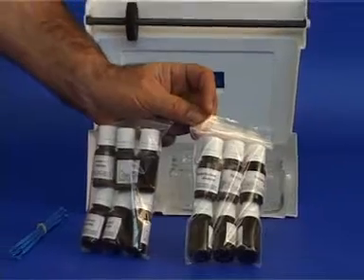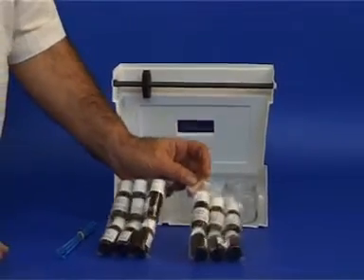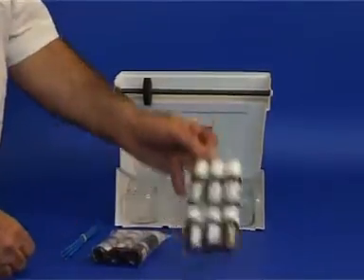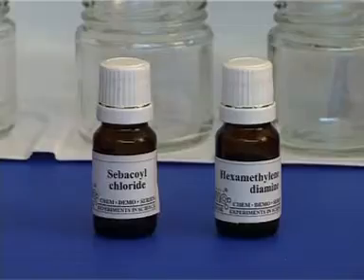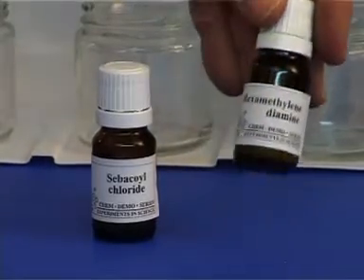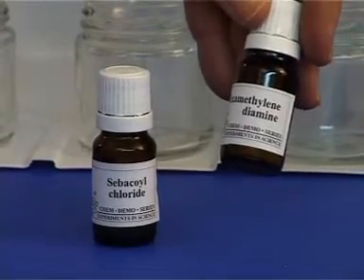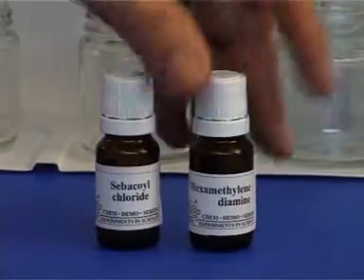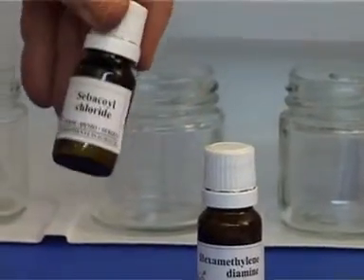This kit contains a package of 12 bottles for 6 separate experiments. Each experiment requires two bottles. One containing a solution of hexamethylenediamine dissolved in water and the second sebacoyl chloride dissolved in a kerosene-like organic solvent.